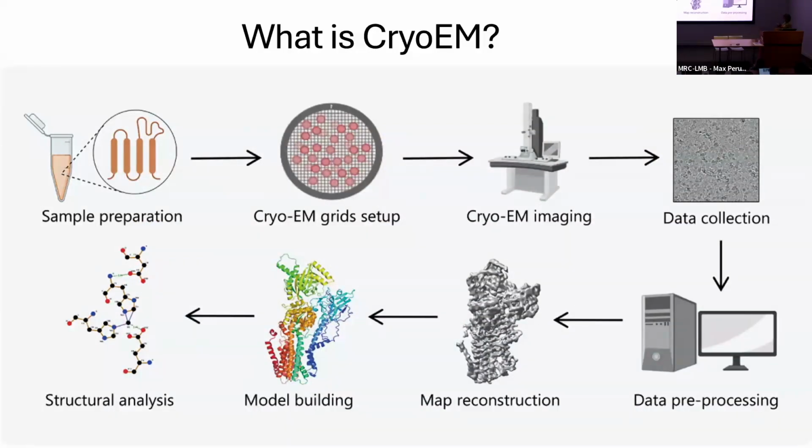So I think you more or less know what cryo-EM is. This is just a schedule. It looks very simple. You have a sample, but the sample needs preparation in the tube, very pure, and then you put it on the EM grid to make one layer of liquid. Here we omitted some steps. You need to quick-freeze to liquid nitrogen temperature, and then you go to cryo-EM to take pictures. The cryo-EM picture is very fuzzy, with very low contrast.